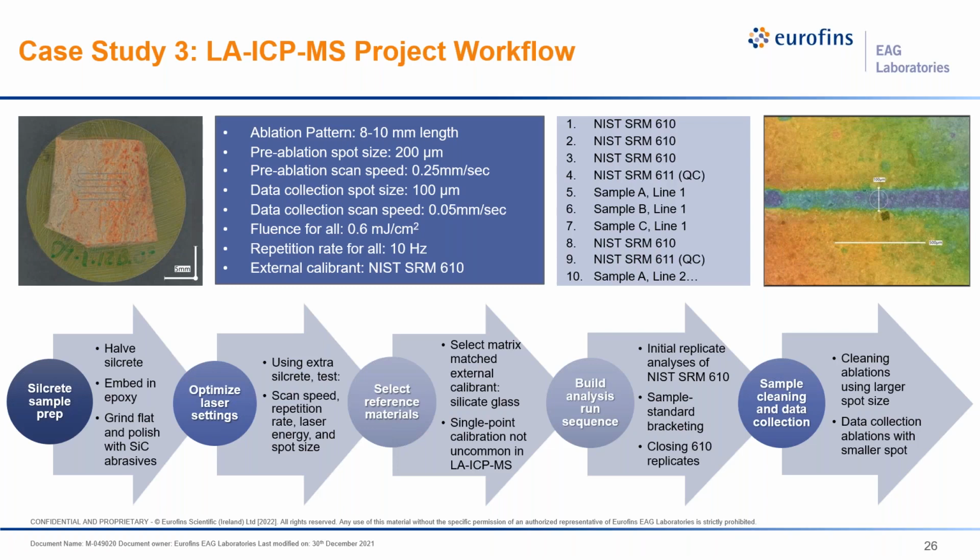So lastly here, you can see that 100 micron diameter laser ablation trough. So I have this depth map right here. This is from microscopy after ablation, just to show you that that initial cleaning ablation, which used a 200 micron diameter spot, has virtually no measurable effect on the sample surface. It's really scouring off barely anything. There's no measurable change in depth on that surface outside the bounds of the main data collection ablation, which is pictured as that trough right there in blue and green.